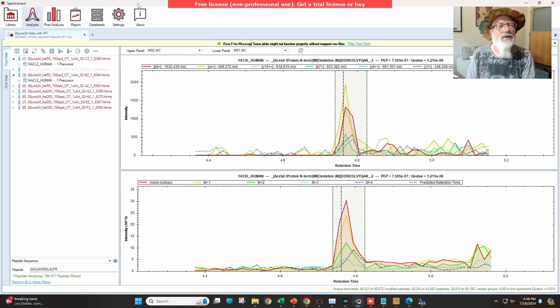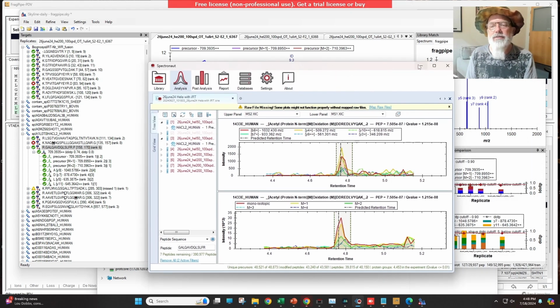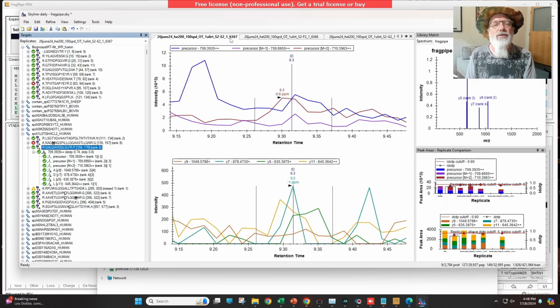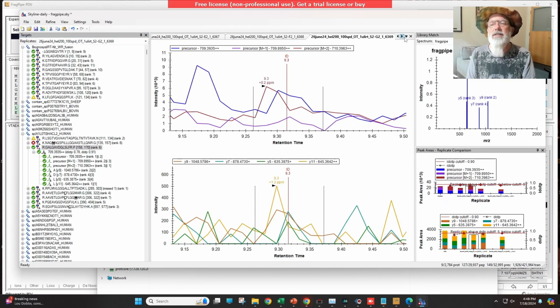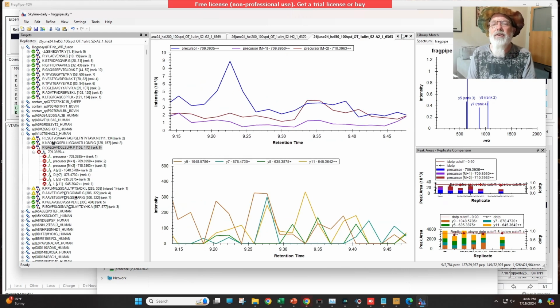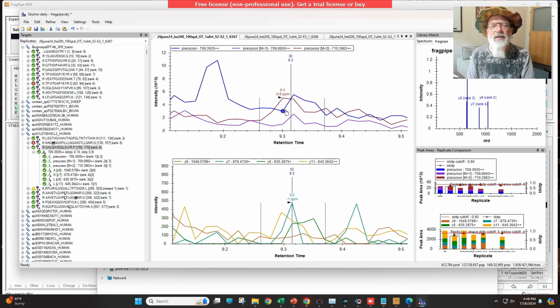All right, so in order to match the correct one, we're going to have to figure out what file this is from, because we have 8 of them. In order to figure this out, let's look at, this is 6367, 6368, 6369. And so you can see all of these here. They're all equally kind of crappy. So let's look at 6367.